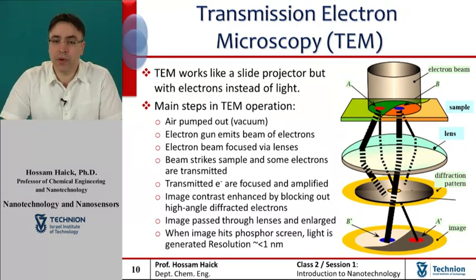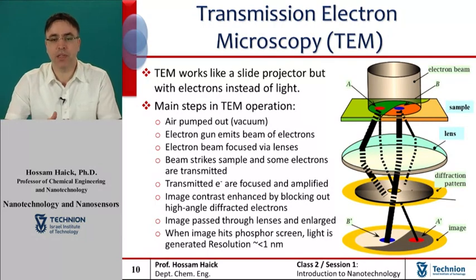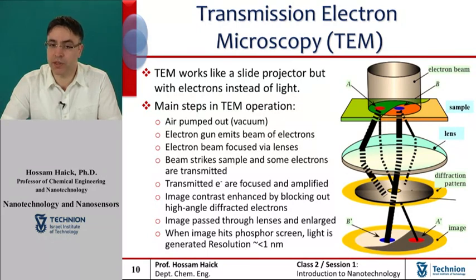There are four main components to a TEM: an optical column, or more specifically, an electron-optical column, a vacuum system, the electronics, and the control software. A modern TEM typically comprises an operating console supported by a vertical column and containing the vacuum system and control panels for the operator. The microscope may be fully enclosed to reduce interference from environmental sources and operated remotely.